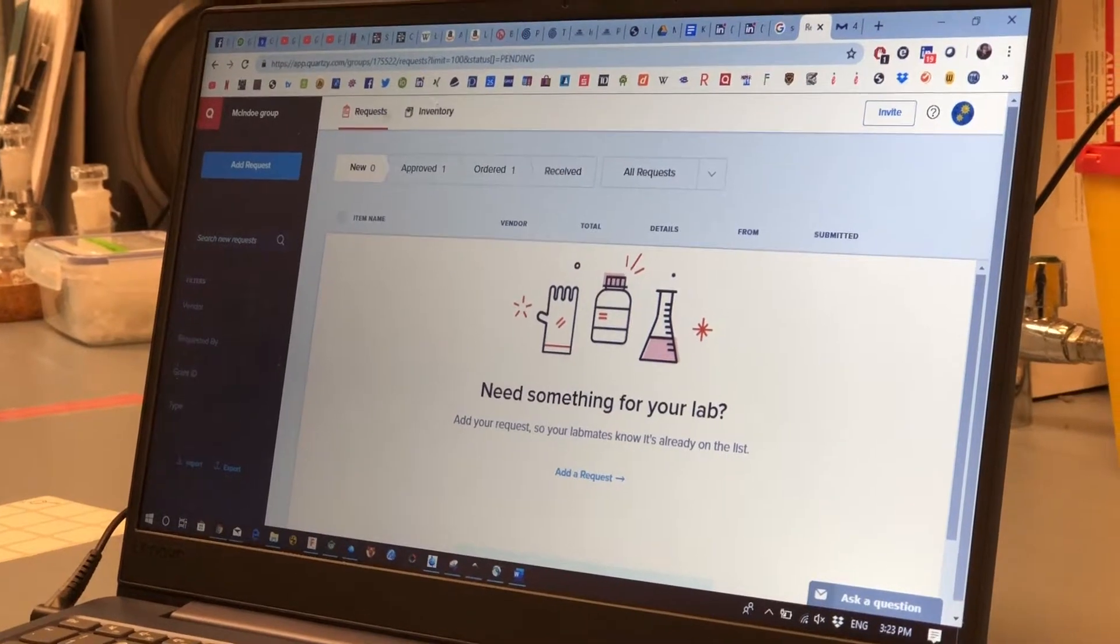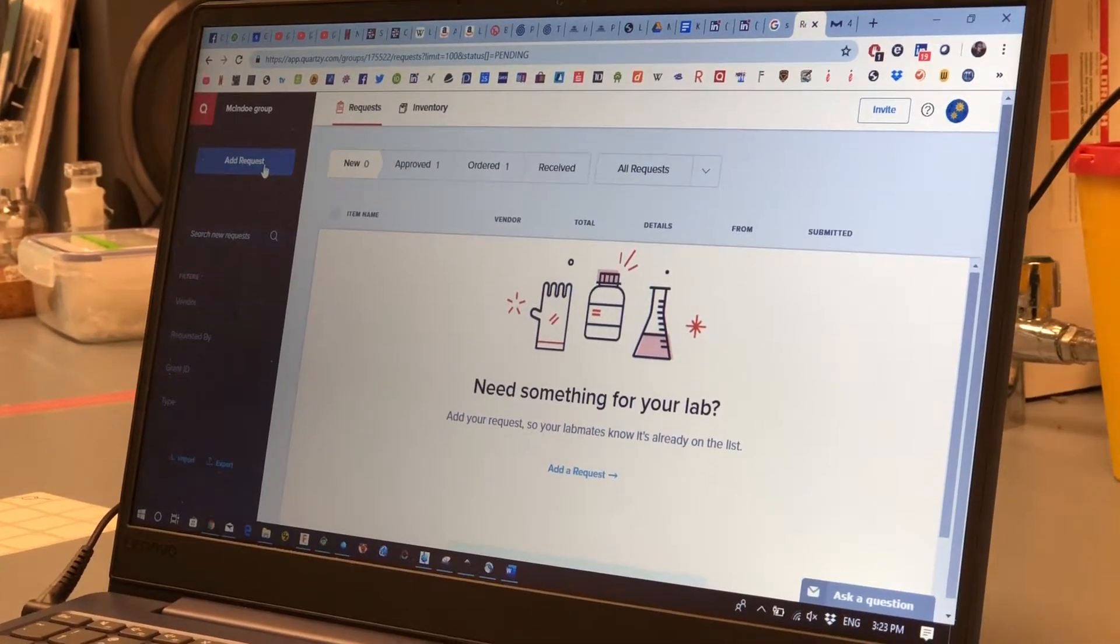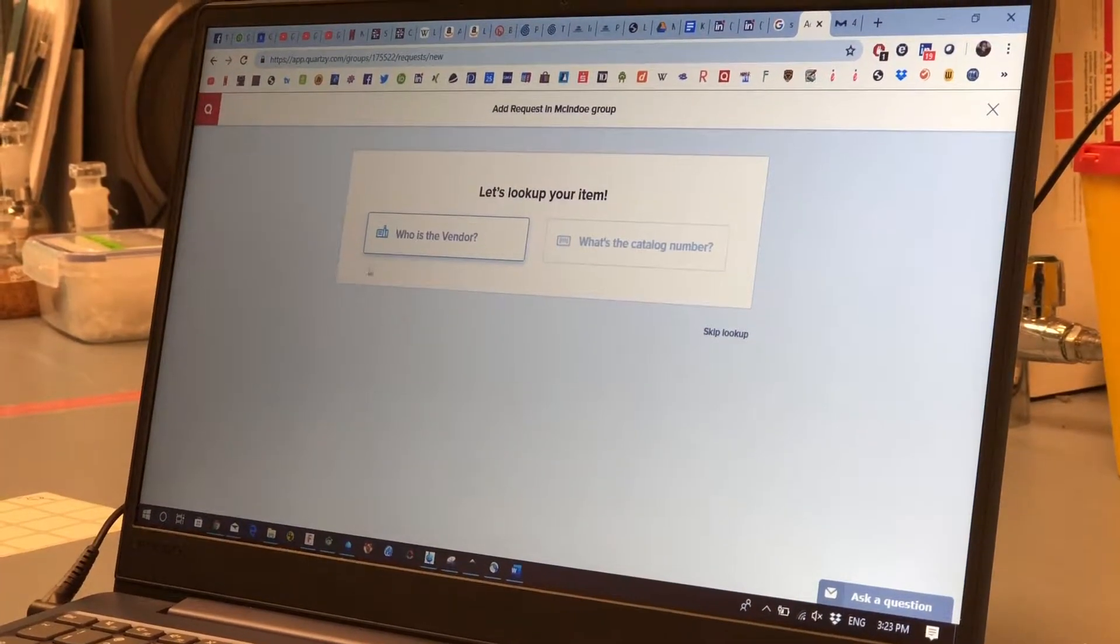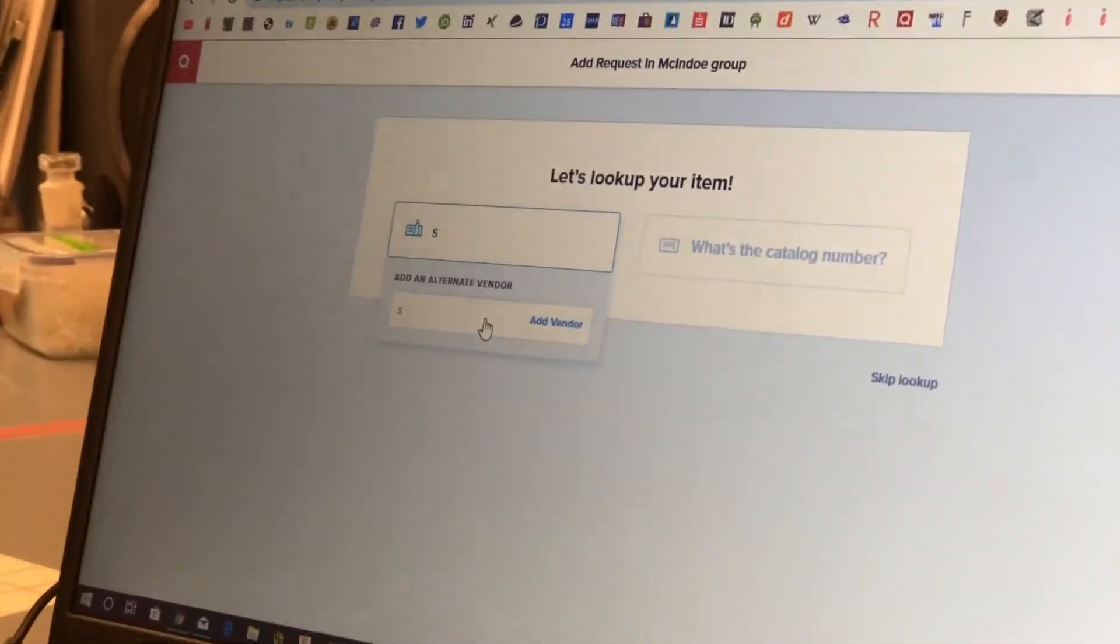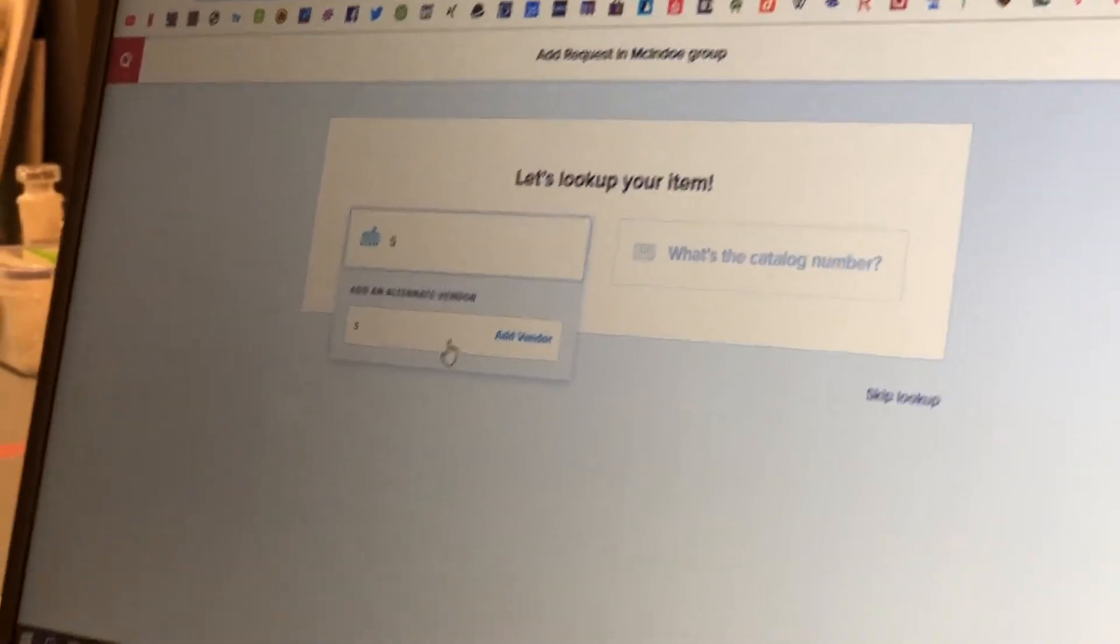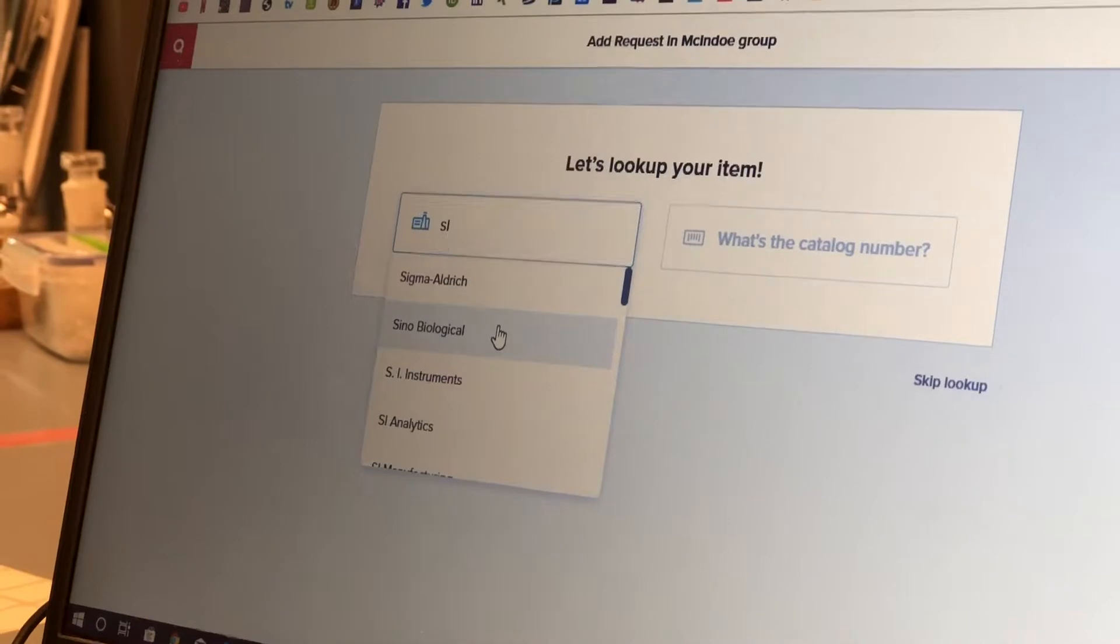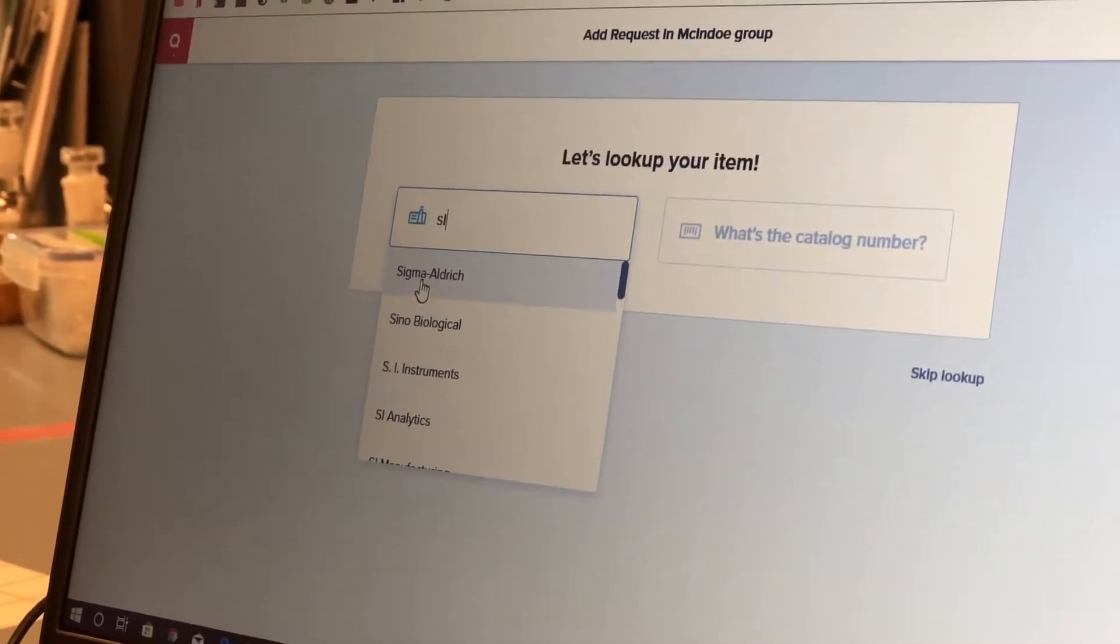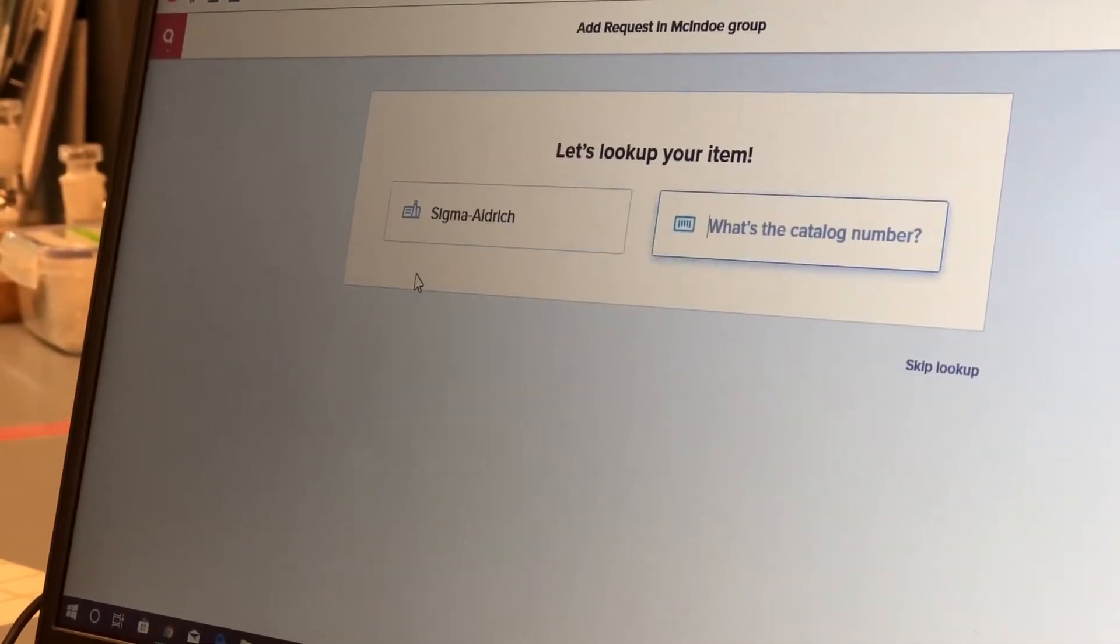When you have your Quartzi account you add a request and it will ask you right away what is the vendor. It has a huge list of vendors so even if I just type in SI it will already find Sigma Aldrich.